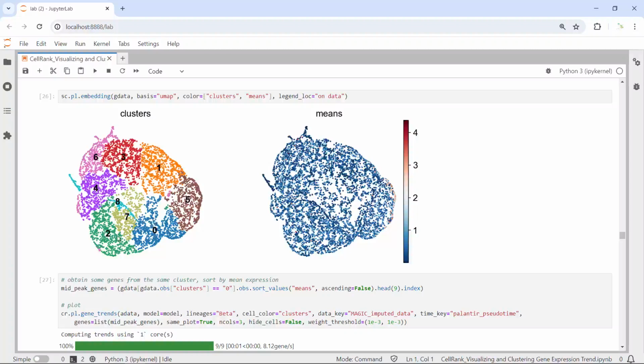Then clusters 2, 7, and 8 are the genes highly expressed in the FEV positive cells. Then cluster 1 and cluster 5 are the genes that are downregulated in the progenitors. Then genes in cluster 3 and cluster 4 are in the pre-stage. Genes in cluster 6 are the genes that express in terminal stage cells.